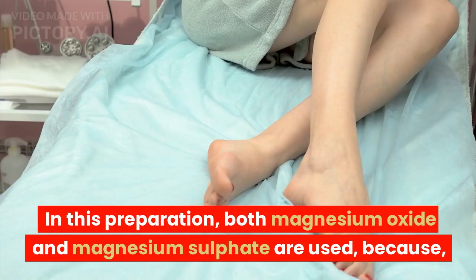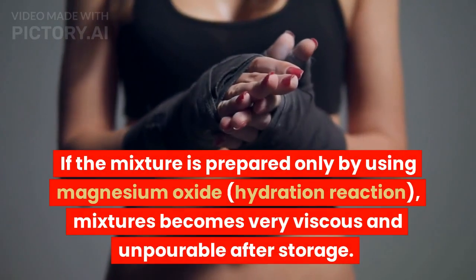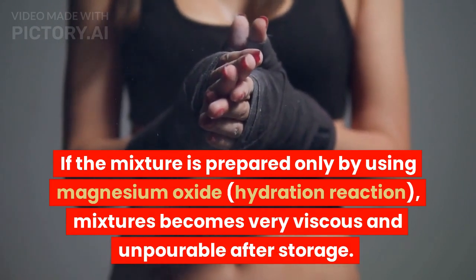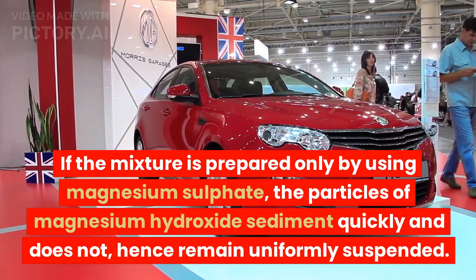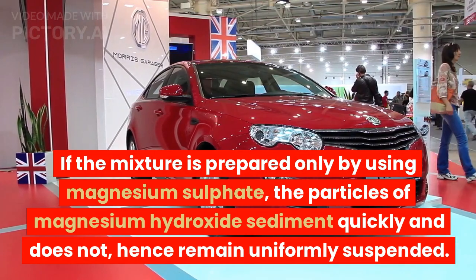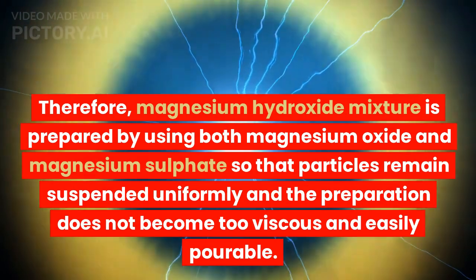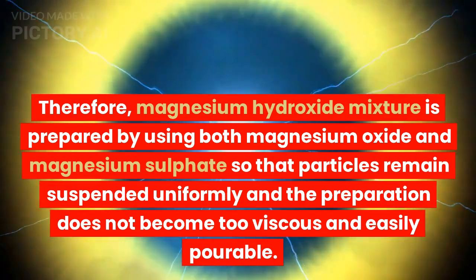In this preparation, both magnesium oxide and magnesium sulfate are used. If the mixture is prepared only by using magnesium oxide, the hydration reaction causes the mixture to become very viscous and impourable after storage. If the mixture is prepared only by using magnesium sulfate, the particles of magnesium hydroxide sediment quickly and do not remain uniformly suspended. Therefore, both magnesium oxide and magnesium sulfate are used so that particles remain suspended uniformly and the preparation does not become too viscous.